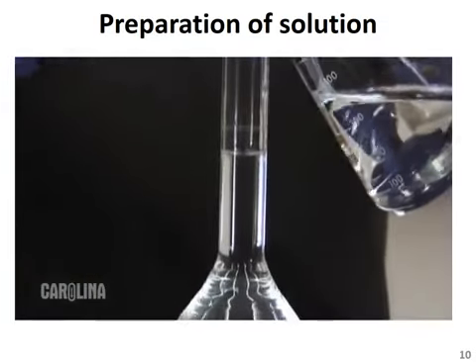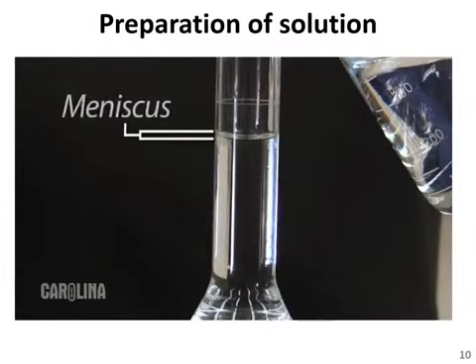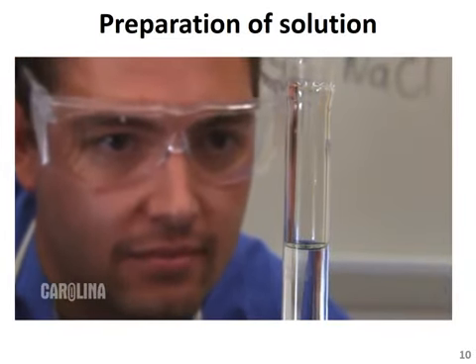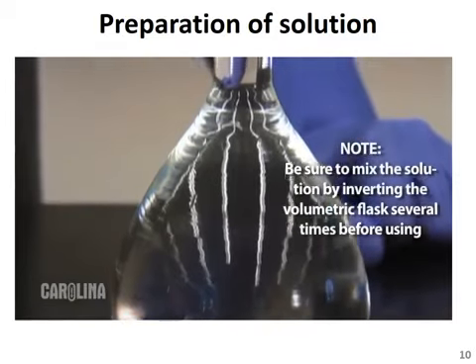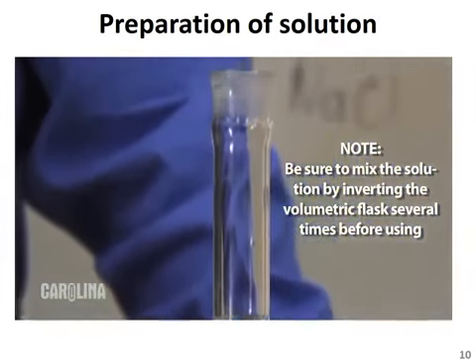Water, as a polar solvent, tends to cling to the glass walls of a flask. This phenomenon creates what is called a meniscus. The bottom of this curved meniscus should sit directly level with the line on the flask. At this point, there is exactly 500 milliliters of solution with an error of 0.2 milliliters.